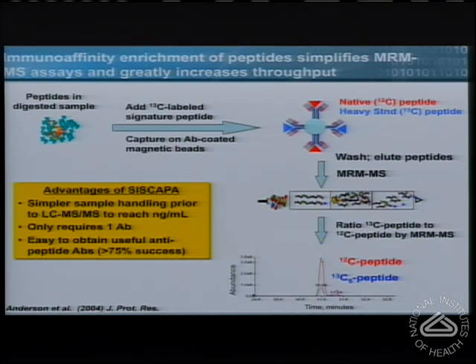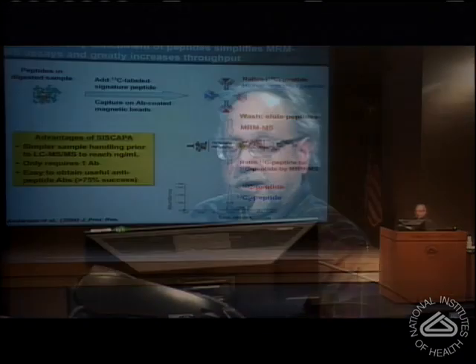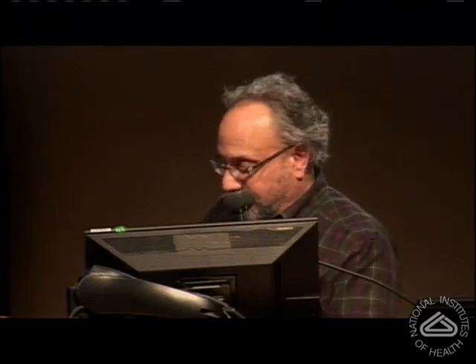Because the mass spectrometer effectively is the secondary antibody here, it is what's giving us the specificity that we would use a secondary antibody for, as well as the measurement. So what are the things that give us that specificity? First, it's the mass of the peptide as measured by the instrument, the fragmentation of that peptide, the relative ratios of the fragments to one another, and the retention time in the chromatographic system. So there's multiple bits of evidence that say this is, with very high specificity, what you think you're measuring is what you're measuring. And then we can do the ratioing.